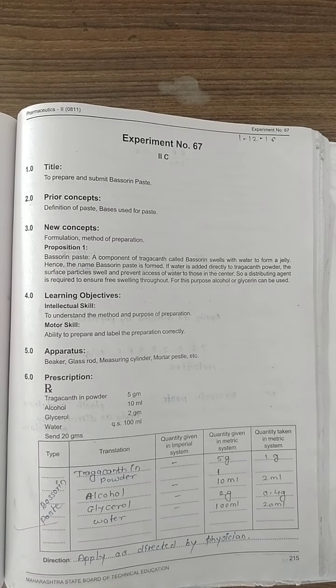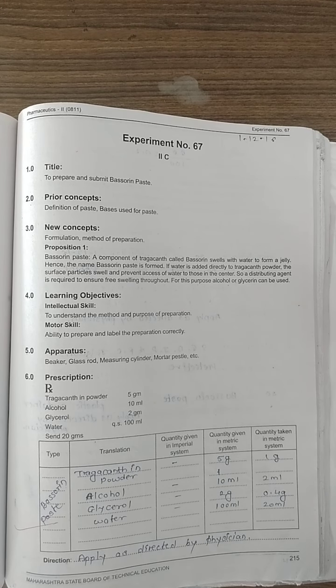Next is experiment number 67 — Bassorine paste. Tragacanth, which we call bassorine, is the key component. When tragacanth powder is added to water, it swells and starts to form a jelly. The outer surface particles swell directly, which prevents excess water from reaching the center. Therefore a distributing agent is required to ensure free swelling throughout.